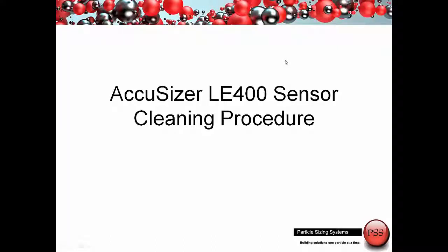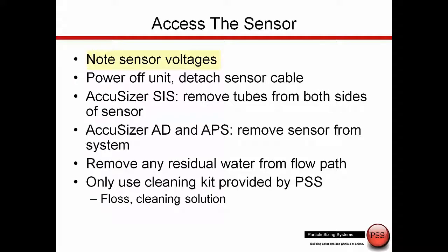In this short video, we will show the proper cleaning procedure for the LE400 sensor. Before we begin, note the sensor voltages, particularly the extinction voltage, which can usually be seen in the lower right-hand corner of the screen.